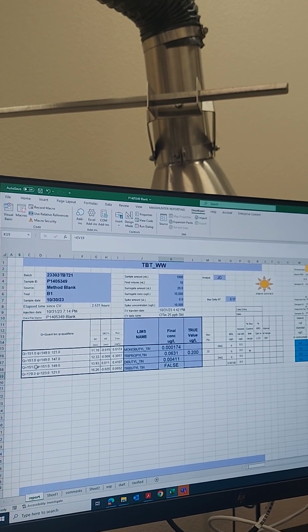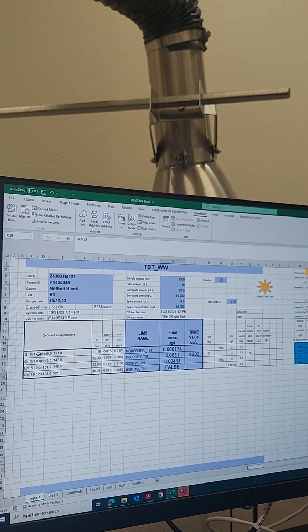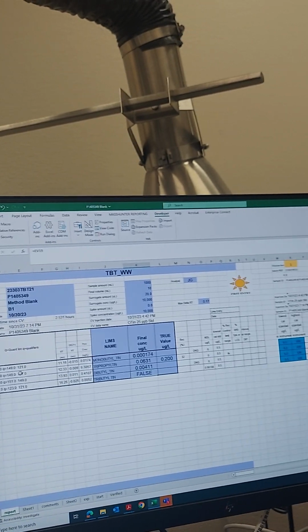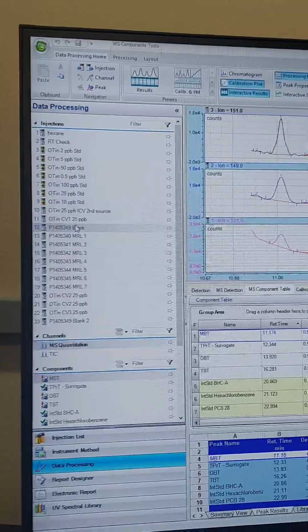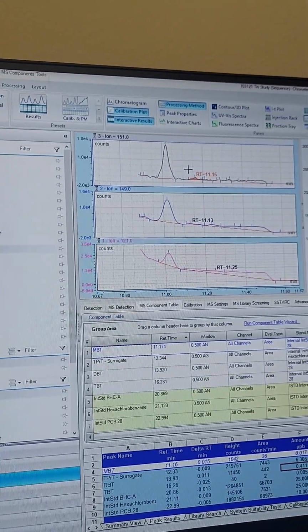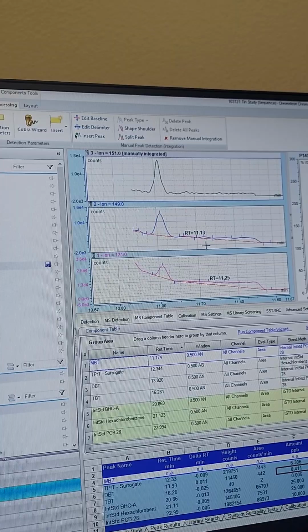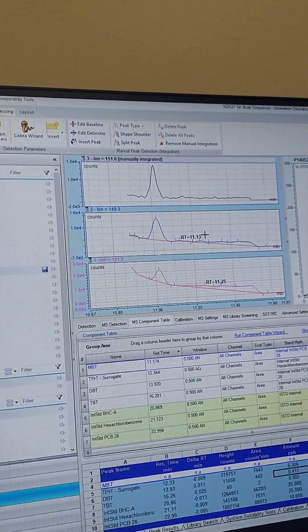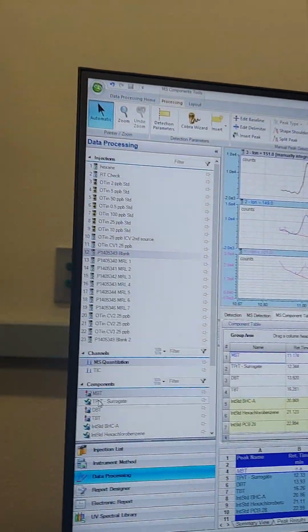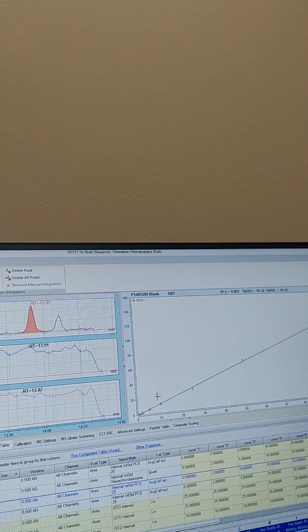Oh, that's because we usually delete the peak. But for this, we only need one analyte. Yeah, so usually we go over here. You put ND, ND, ND. No, let's go to that computer. Go to the blank, and we see that's not a real hit. Yeah, we should delete it. Okay. So let's see, processing. Delete peak, all peaks. Yeah. Because that wasn't a hit, so that looks good. Let's check the next analyte. This is a surrogate. It looks good. Even though it's so low, it's fine. This kind of looks like a hit.